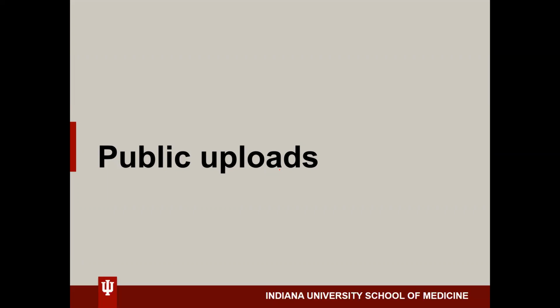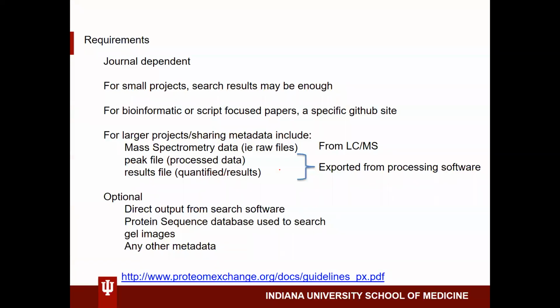But the field has moved to a few different databases that are most commonly used, ProteomeXchange. And if you're getting ready to upload for a paper submission, you're going to want to think about what the journal requires.